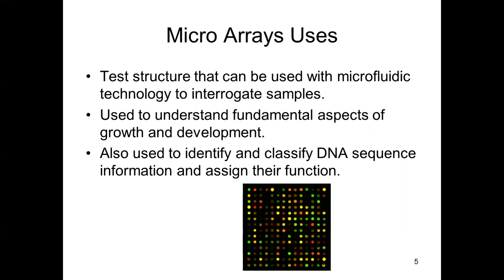And each one of those visual colored spots on there is generally a metal section, and on that metal section we have a specific encoding, a DNA encoding. And then what we would do is run the patient's sample across that matrix, and if it had that specific encoding in that specific area, it would light up in that response. So that's what we do. We can basically take known DNA sequence on this template, run across a patient's unknown sequence, and when they hybridize together, we're going to be able to see a visual response.